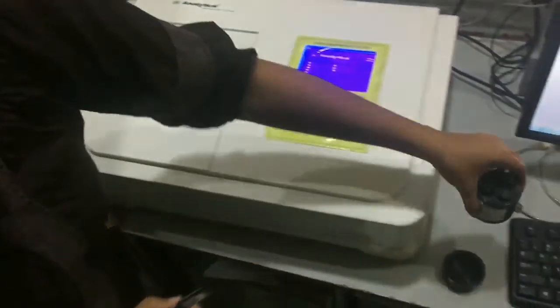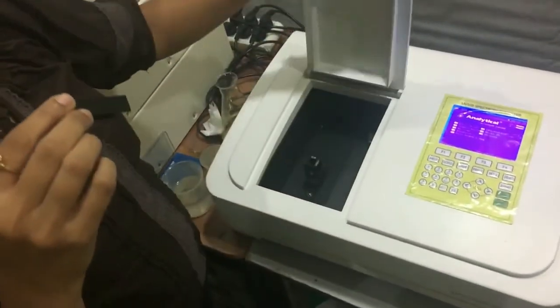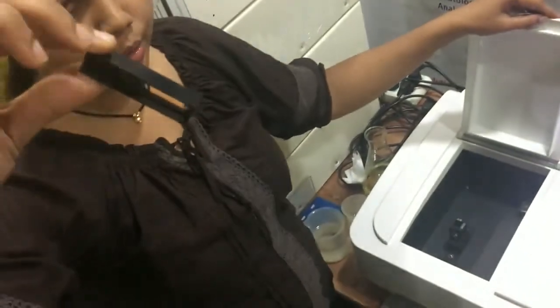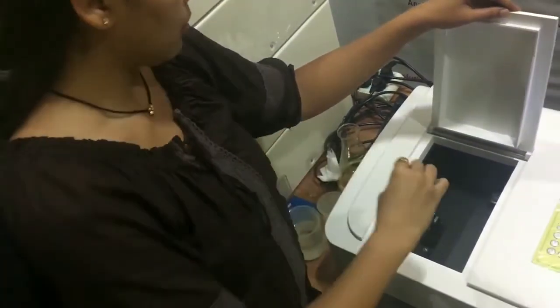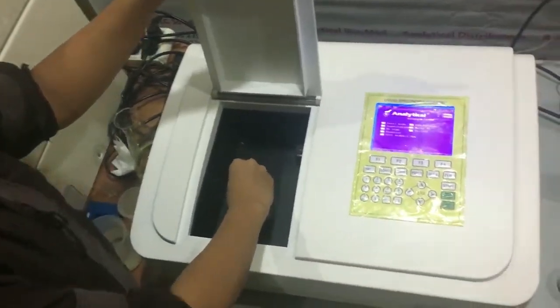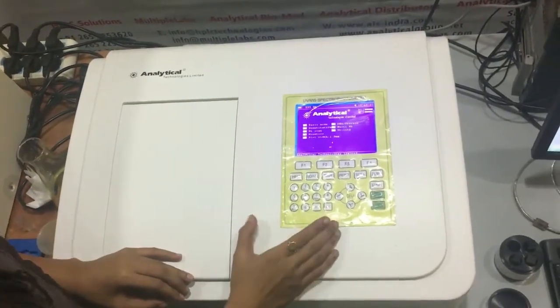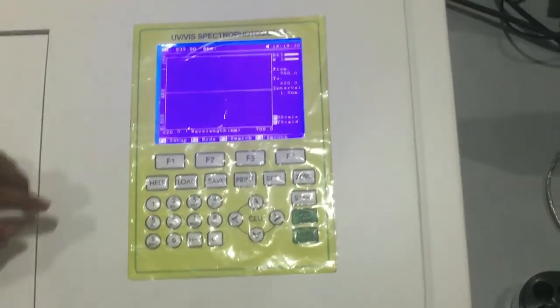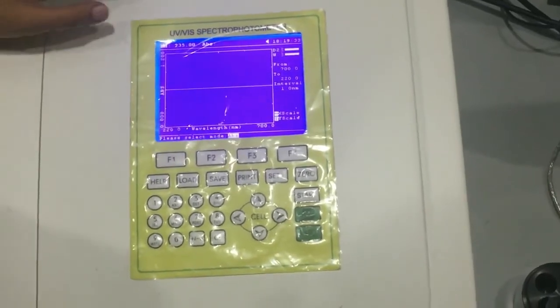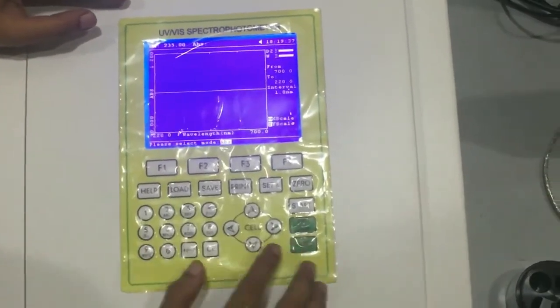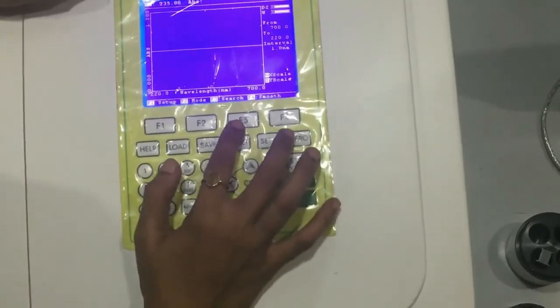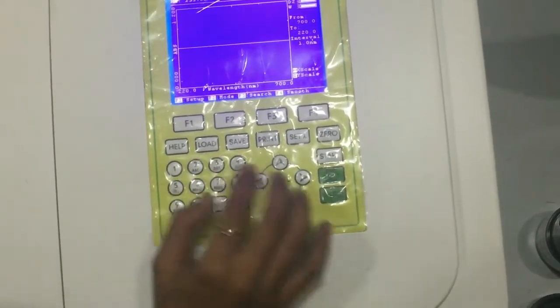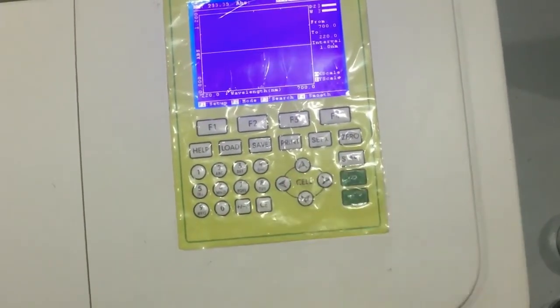For system calibration, we use a holmium glass filter. This looks similar to a cuvette. For system calibration, you can find a particular glass bottom on the filter. Place it in the light sample port. In the wavelength scan option, press 3, click on the filter, and set the filter to start calibration.